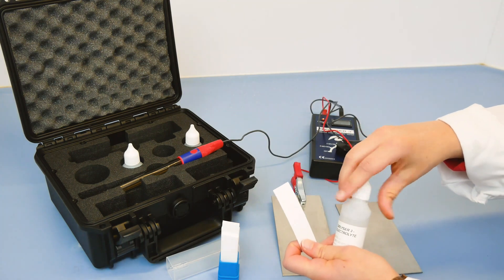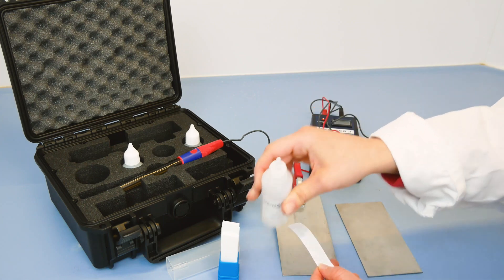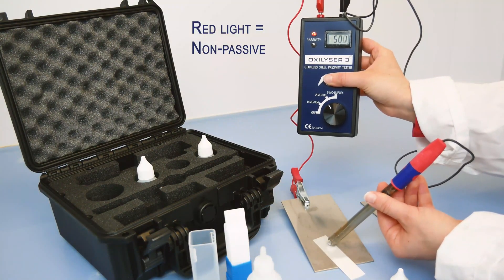We can measure the vertical surface instantly and the test enables us to precisely measure the condition of the chromium oxide layer. If the stainless steel surface is non-passive, the LED light will be red. It will be green once passive again.